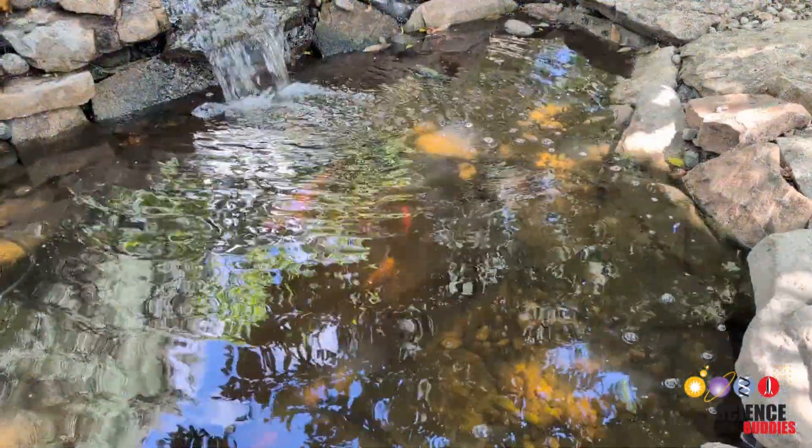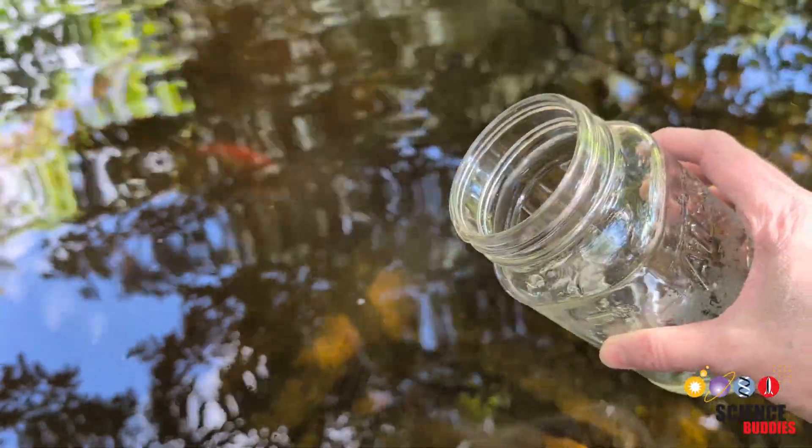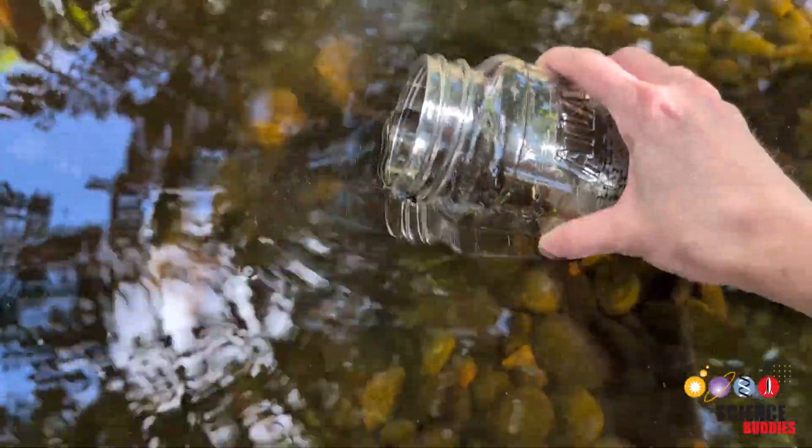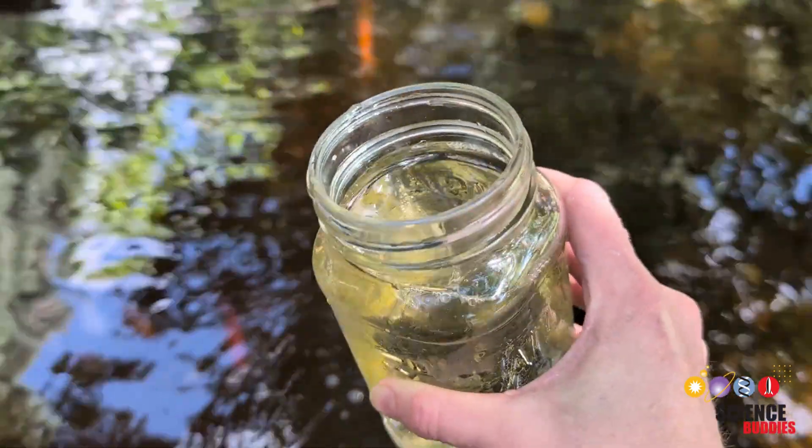You want to find a good water source that probably has a diversity of microbes, so you can take your jar and just go ahead and fill it up. So we have a nice sample of the water.